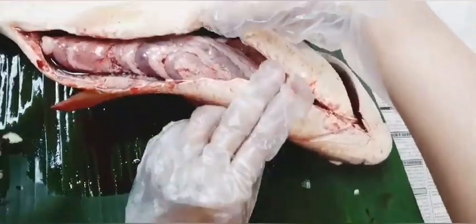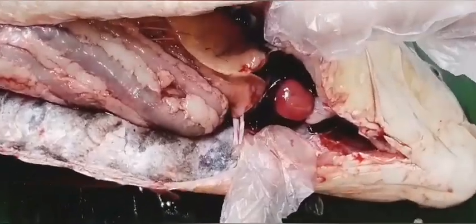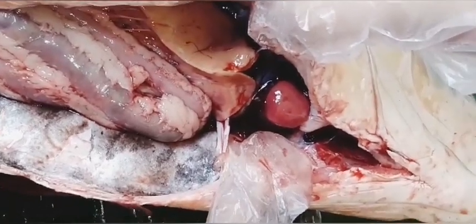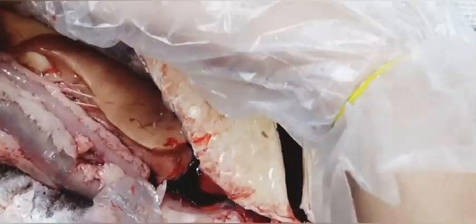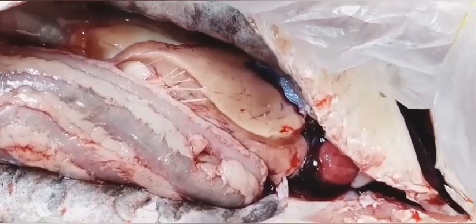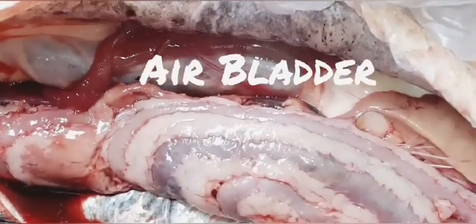I think it is visible from here. I especially want to show you the heart. So it is the heart, and fishes generally have 2 chambered hearts, and it is very much useful for respiration, and fishes have a single circulation. And if you can see, it is the liver. These are all the small intestine, and I guess that this white part that is present is the air sac which helps the fish to float in the water.